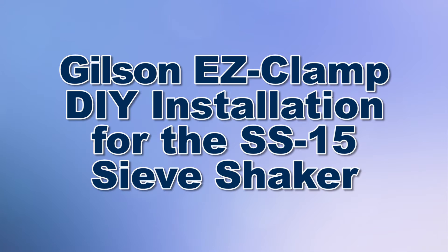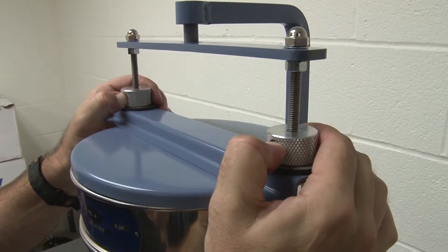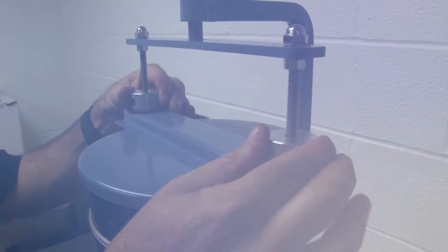Today we're going to demonstrate how to upgrade your existing Gilson SS15 8-inch sieve shaker with the Easy Clamp System, which is a push-button release system that slides freely up and down the clamp rods for a smooth, easy and more efficient sieve clamping operation.